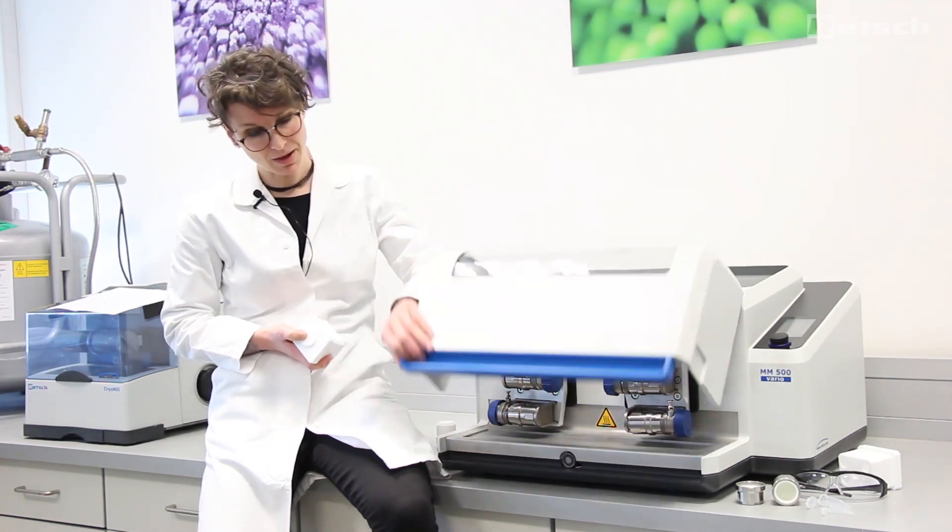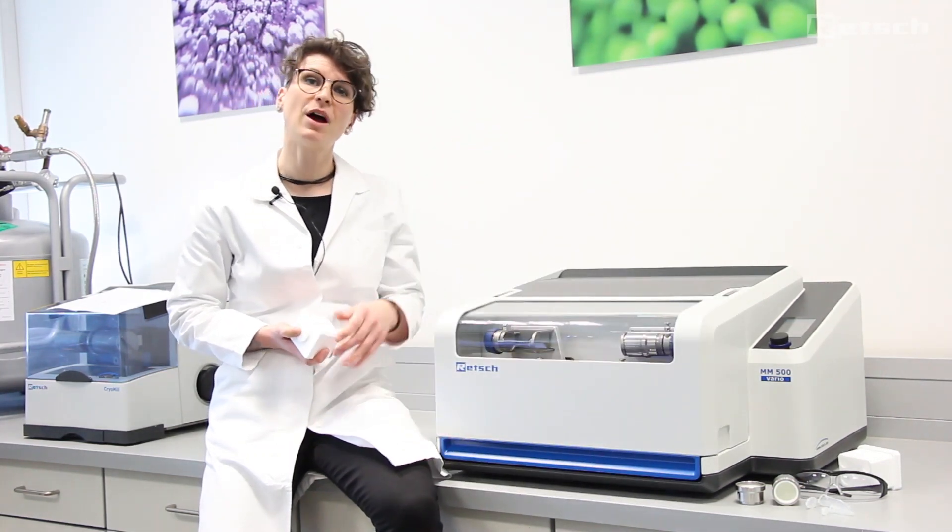To sum it up, the MM500 Vario is a powerful, versatile instrument for the pulverization of a large variety of sample materials with high energy input.